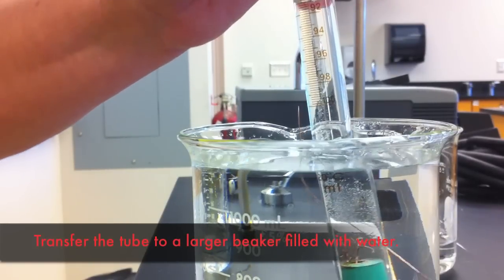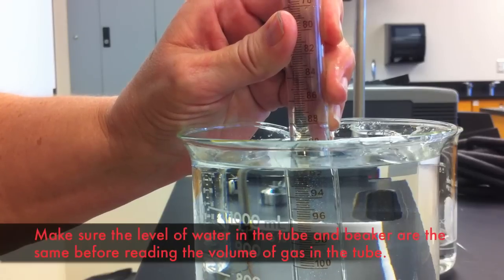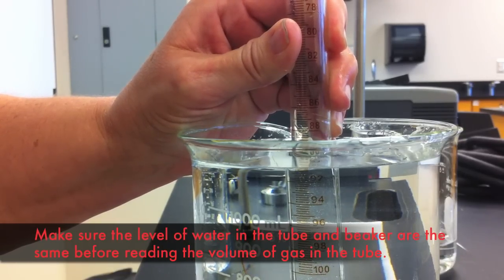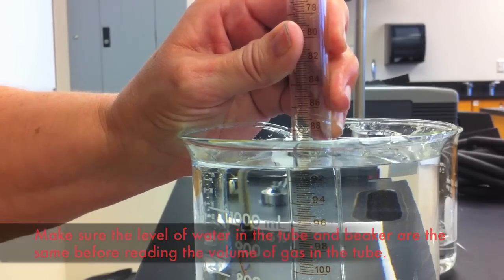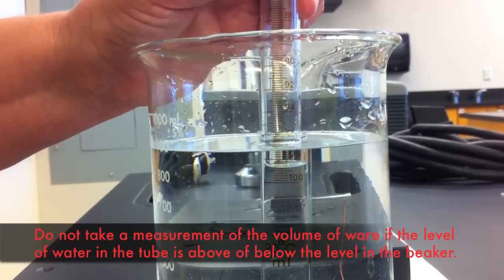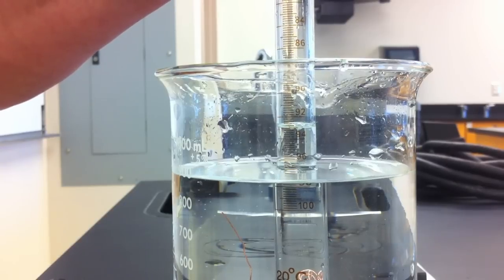In order to measure the volume of gas in the burette tube properly, you need to have the level of water in the burette tube and in the beaker at the same height. Make sure that you have sufficient water in the beaker in order to accomplish this. There will be errors in your measurement if the level of water in the burette tube is either above or below the level of water in the beaker.